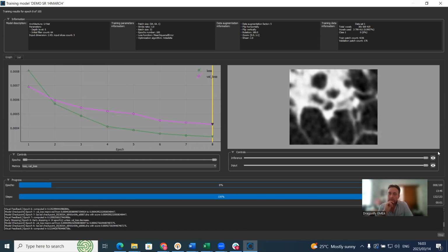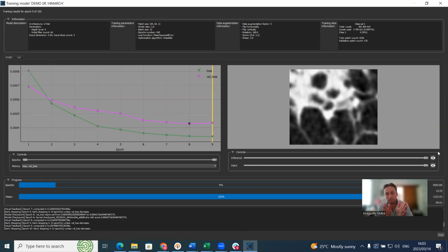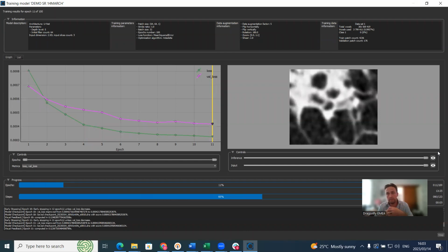The aim here is to show you where the tools are and how they work and what is needed. Just while it's training, to repeat, what you need is you need to align the data sets together. You need to crop them using the same shape box, using an extract structured grid method, so that both are extracted using the same pixel size, so that you have the higher resolution pixel size for both.